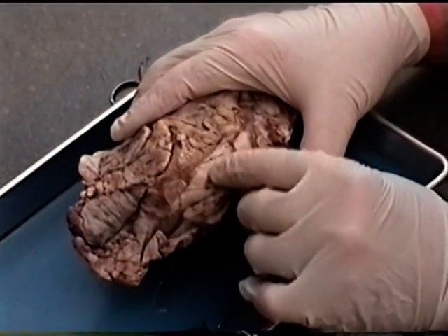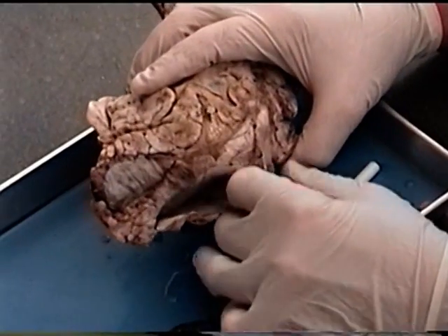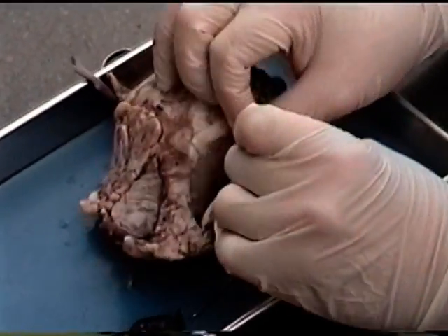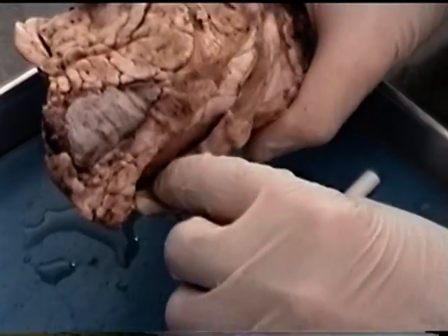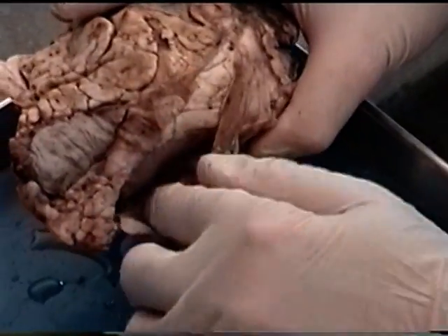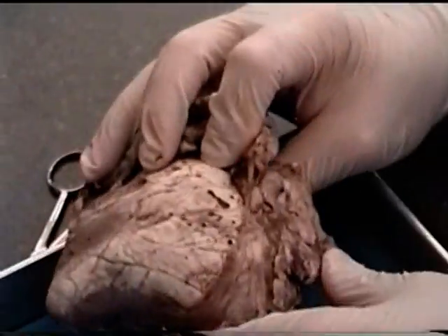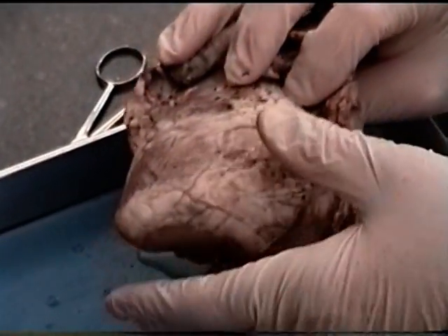So what we did is we cut through the pericardial sac. What you'll notice is now we have a sac that surrounds the heart. The outside of this is called the fibrous pericardium. The inside, which is a shiny surface, is the parietal pericardium. There's a space where pericardial fluid would be found, which is the pericardial cavity. And as we pull this backwards, we'll see that the heart itself is covered by a nice shiny surface that we would call the visceral pericardium or epicardium.